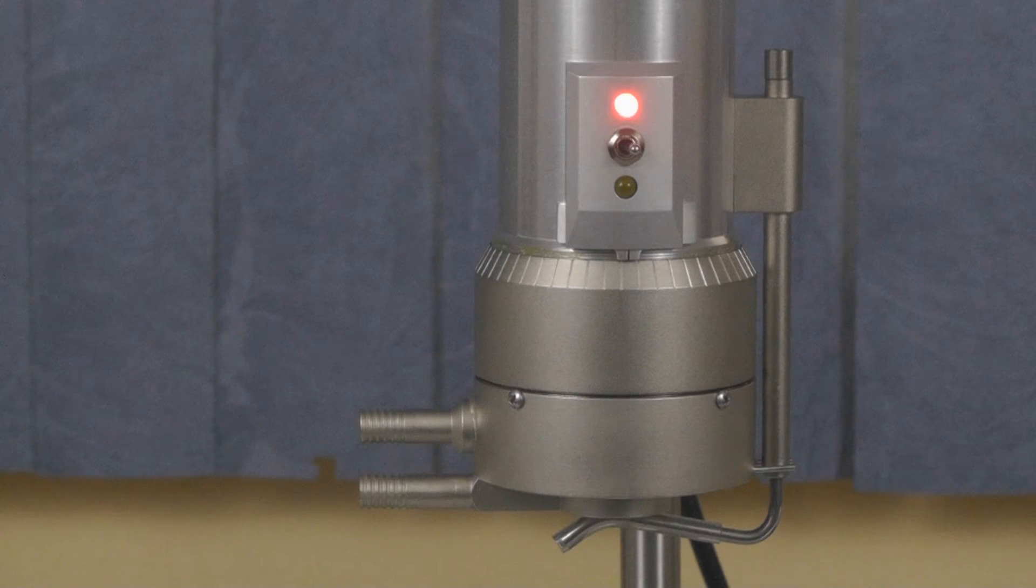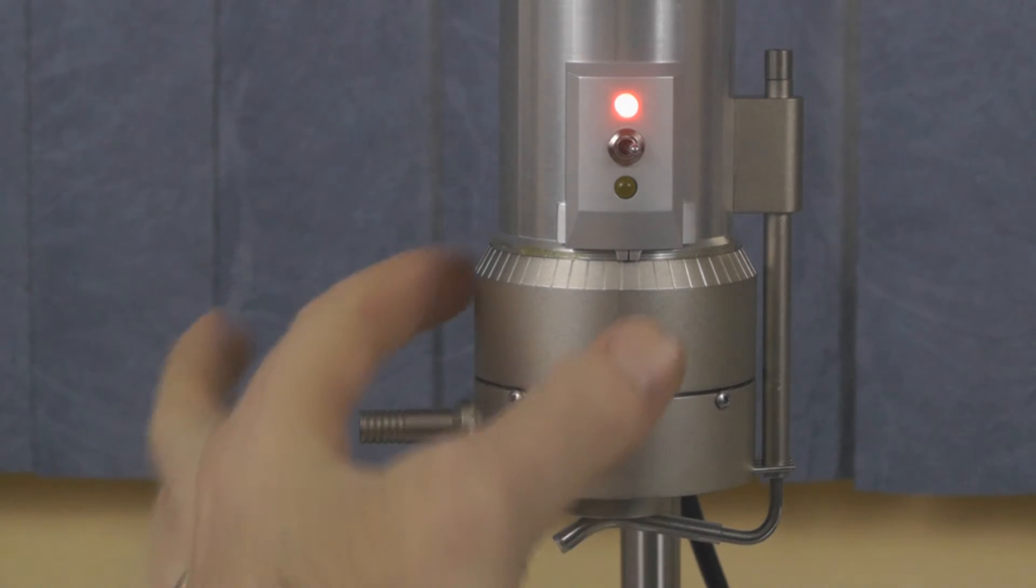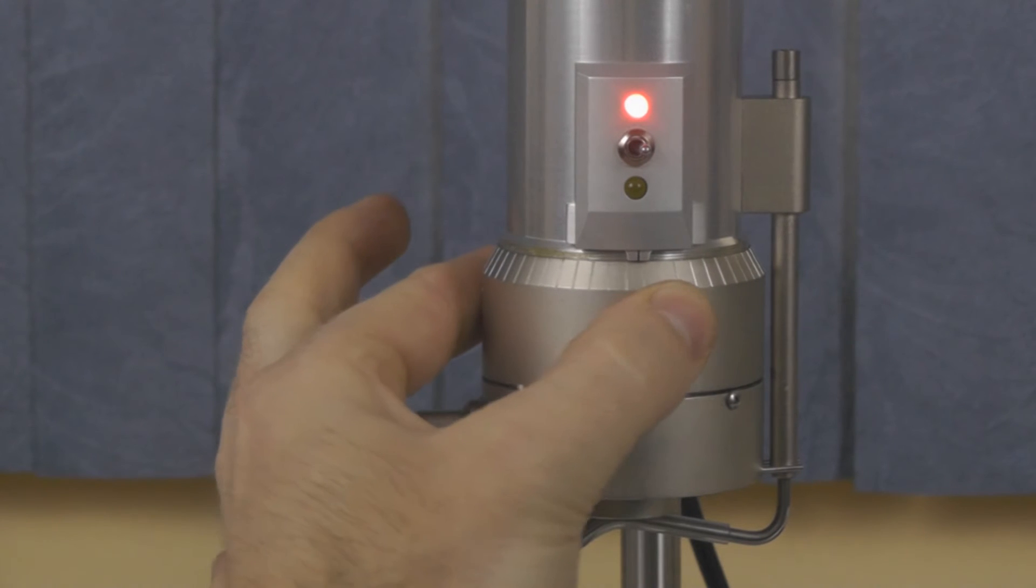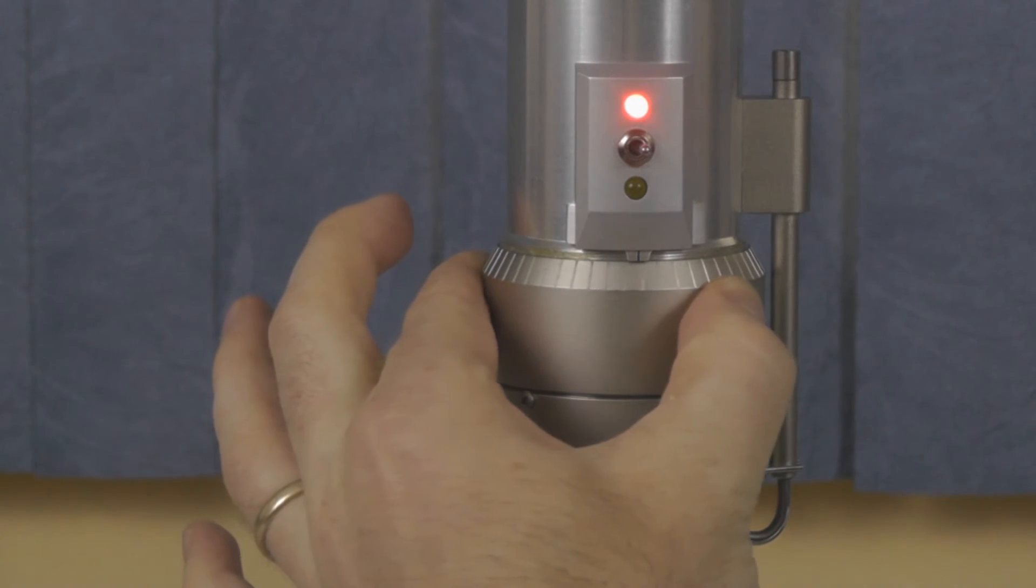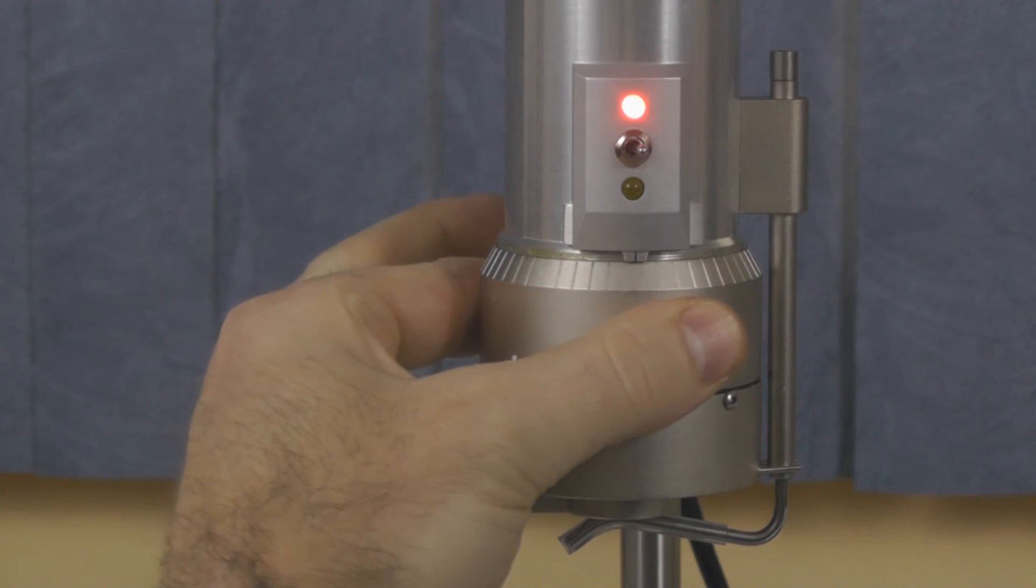When the sample cup is secured and the yellow light is off, you can now set the gap. Slowly move the micrometer counterclockwise until you see the yellow light appear. This point where the spindle first touches the sample cup and completes the circuit is known as the hit point.